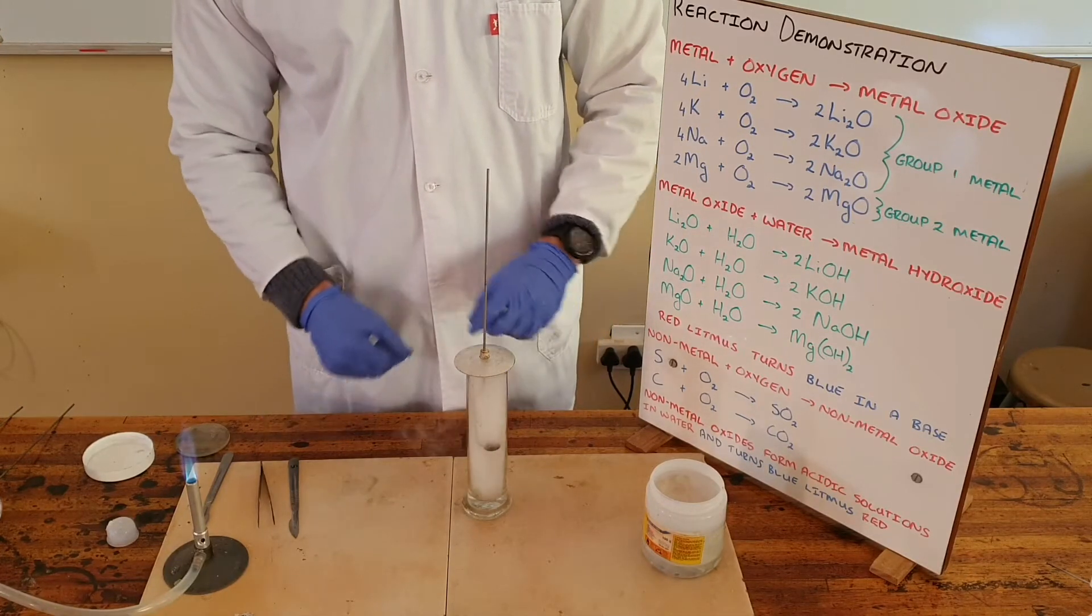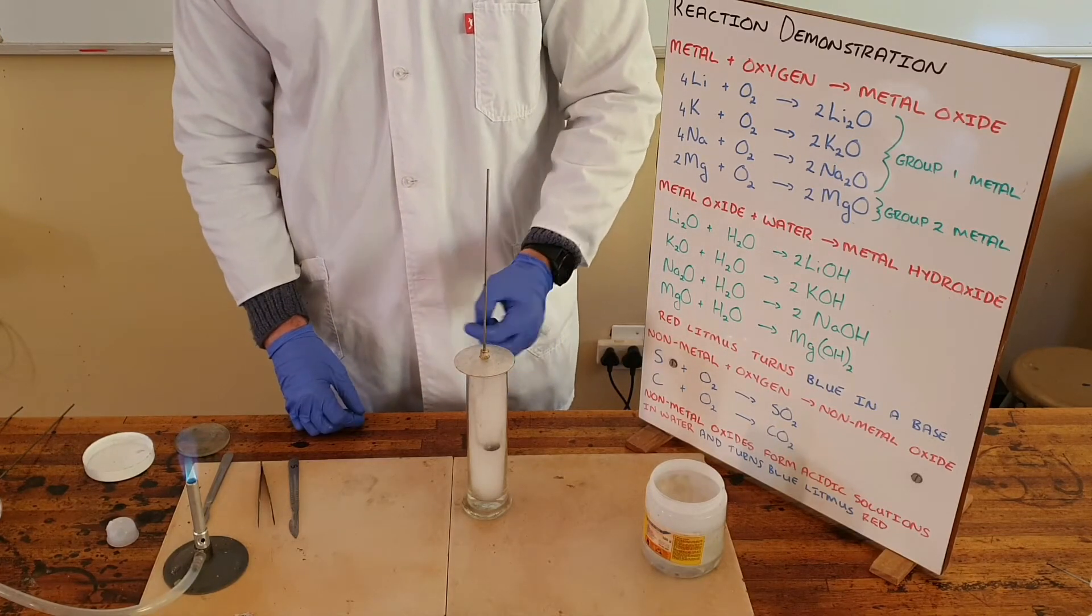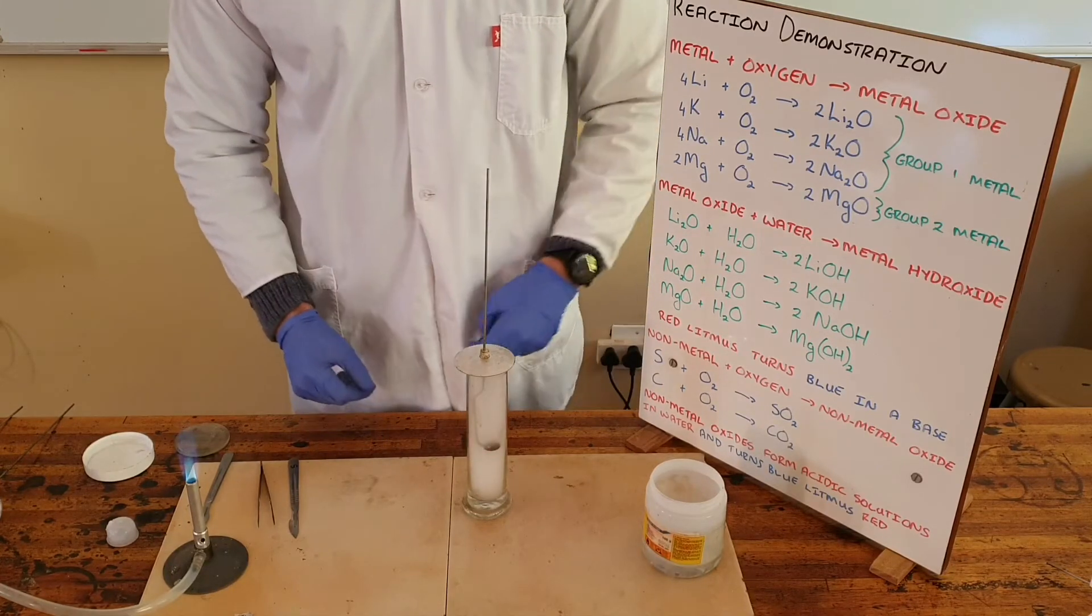We can now see that there is a certain amount of potassium oxide being formed in that white smoke, which is now reacting with the water that is in the bottom of the gas jar. We know that when a metal oxide reacts with water it forms a basic solution.